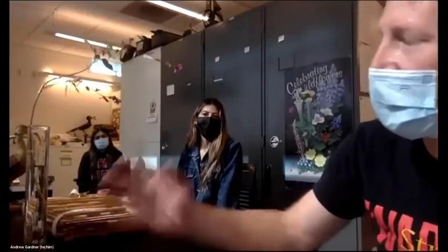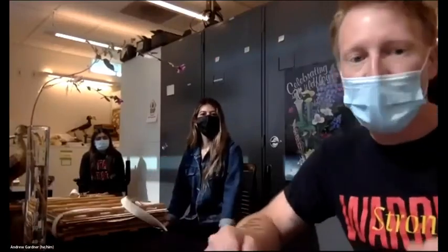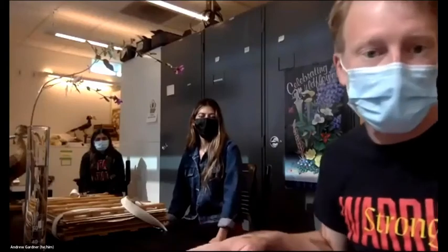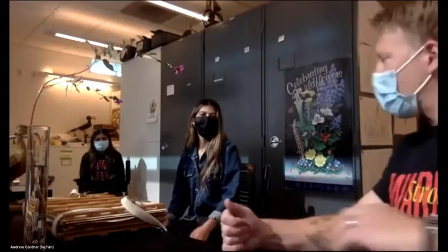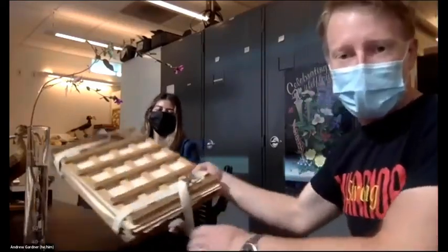So, right, plants and most things occur in life in a 3-dimensional form, but it's much easier to store things if they're in 2 dimensions, right? Like a piece of paper. So what we're going to do is make that change. So the way we do that is we use a plant press. So this is a plant press here.